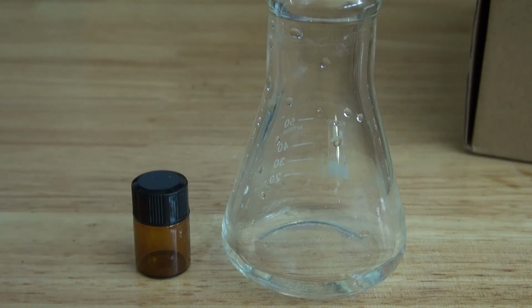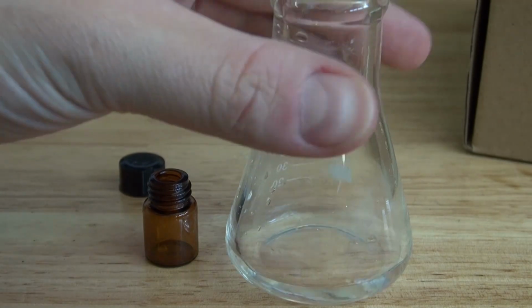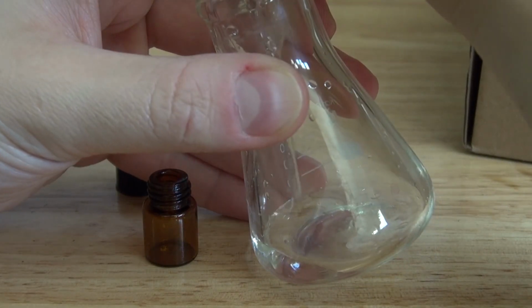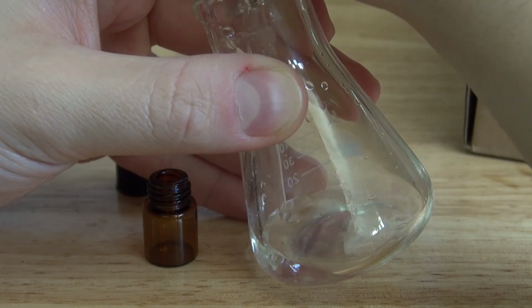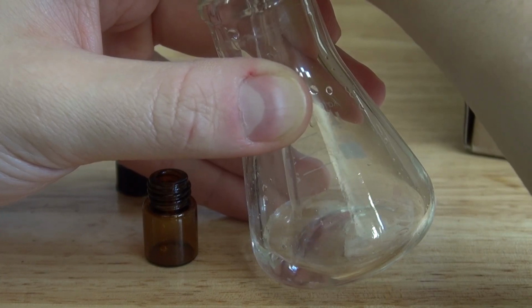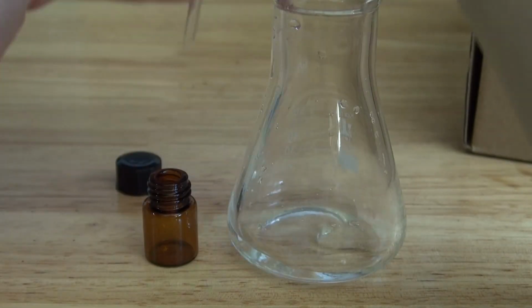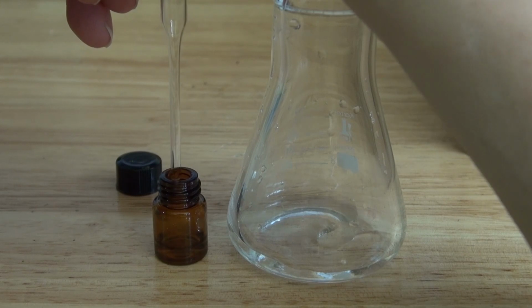Next, I'm going to go ahead and collect some of the rose oil that I've collected in this Erlenmeyer flask, and put it inside of this amber vial. I'm going to use my pipette and collect some of the rose oil that is on top of the surface. It's not much, but it's a little bit of something. Carefully. And there we go, I have a little bit of the rose oil with some hydrosol mixed in with it.